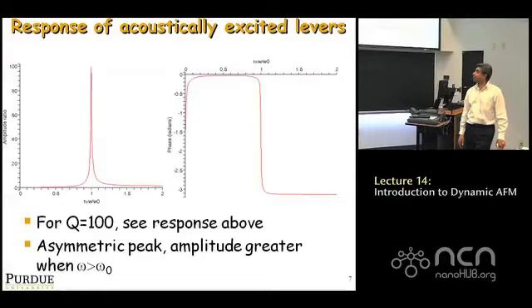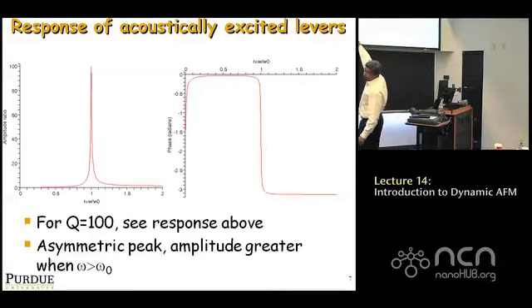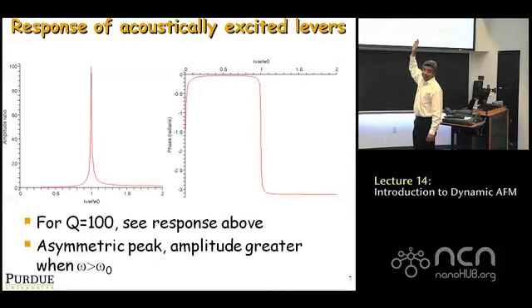And so the typical thing that's done is you go along the amplitude axis, go to the peak point there, and click on it and say, I'm centering my phase there. And then it just adjusts the measured phase so that that point corresponds to 90 degrees.